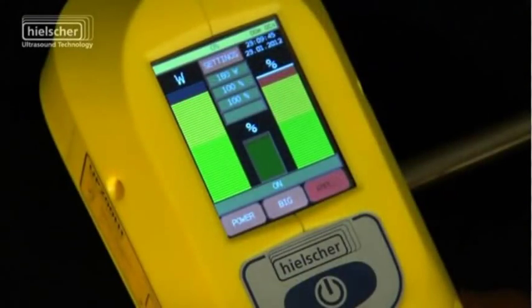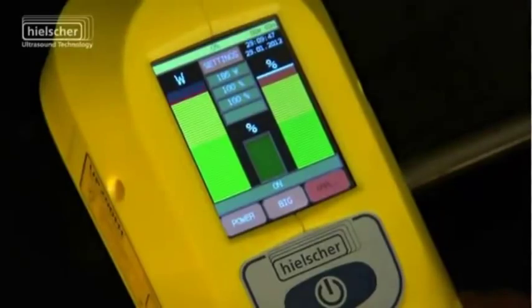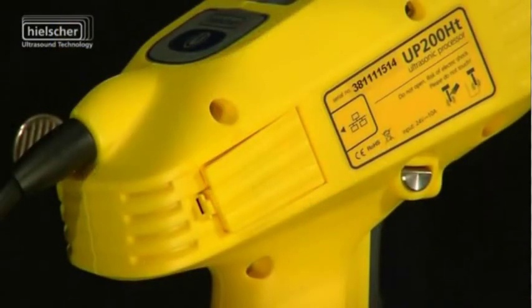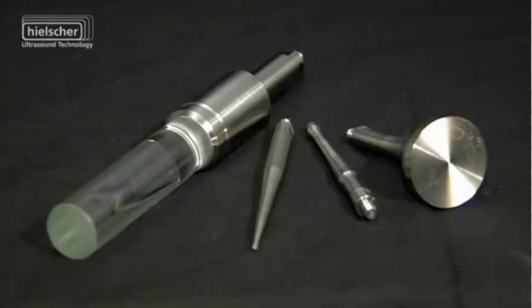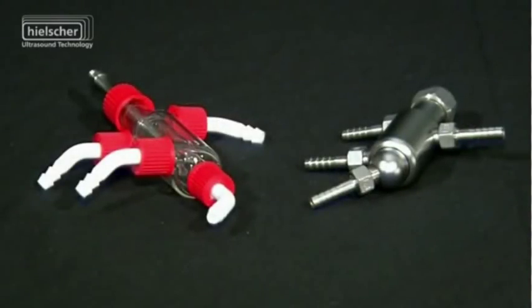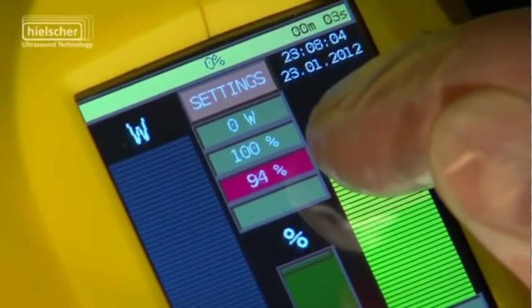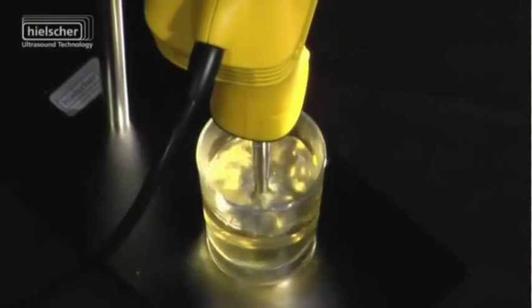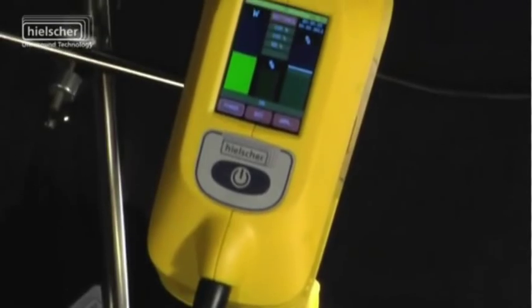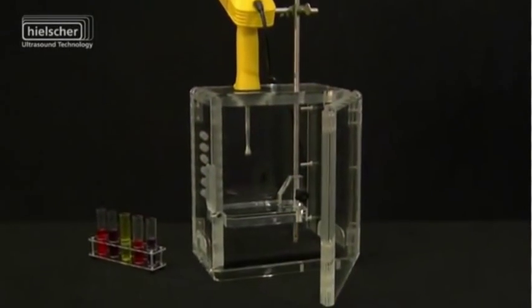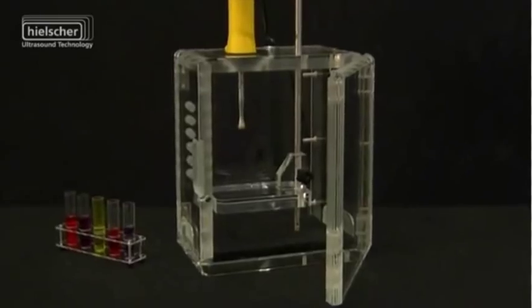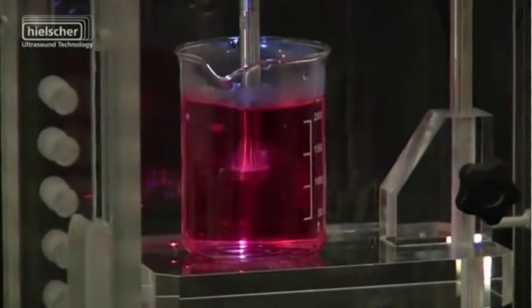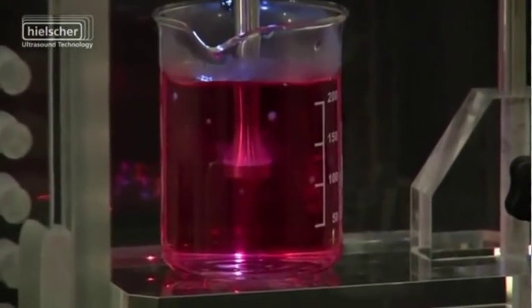With its 200W power capacity, integrated temperature sensor, and LED sample illumination, the UP200HT is significantly more powerful than a comparable ultrasonic bath or cleaning tank. Thanks to a wide range of accessories, the user-friendly color touch screen, and the LAN interface, the Hielscher ultrasonic homogenizer UP200HT sets completely new laboratory standards.